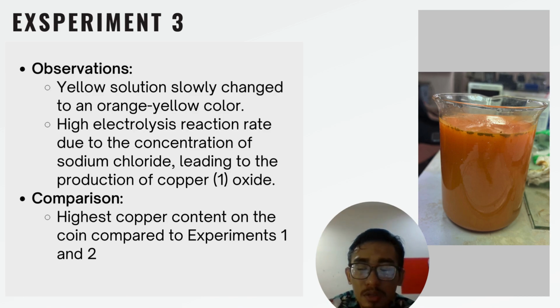in the solution, resulting in oxygen ions taking over and reacting with the copper at the anode and producing copper oxide, which is orange in color. In this experiment, the copper content covering the coin is the highest compared to experiments 1 and 2.